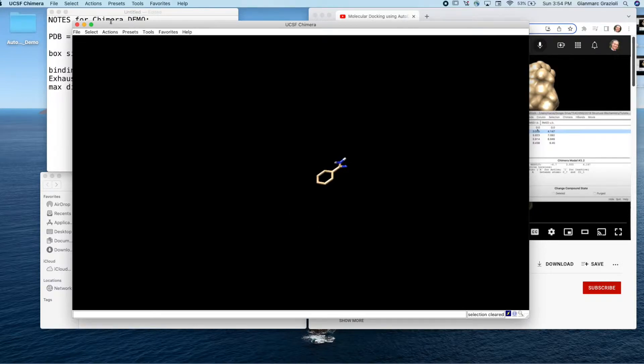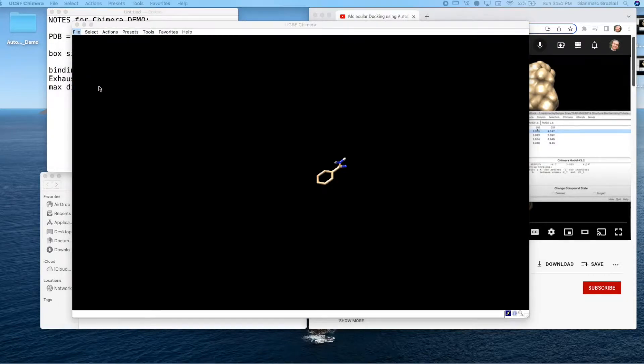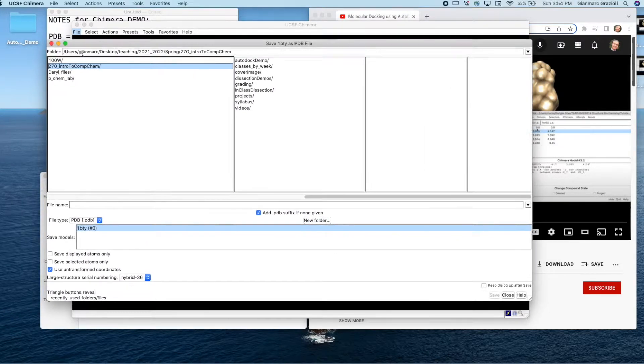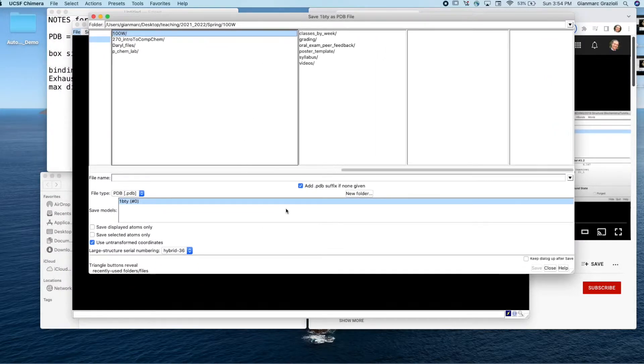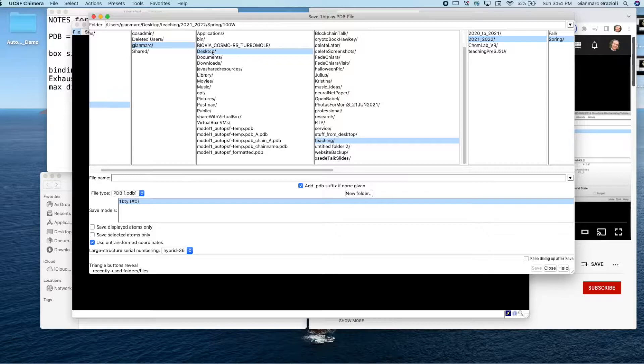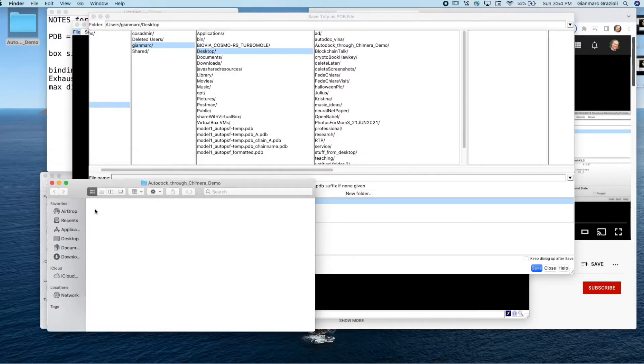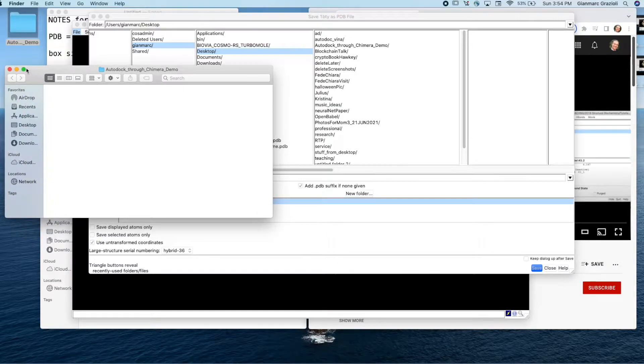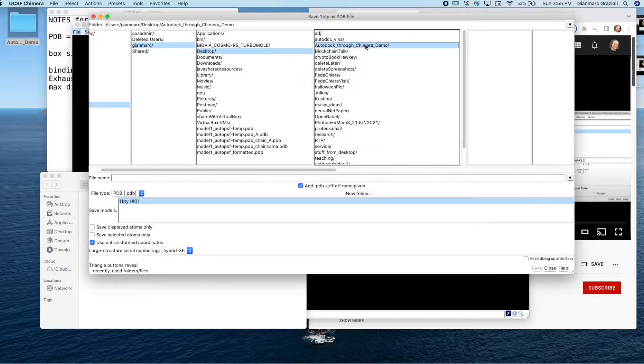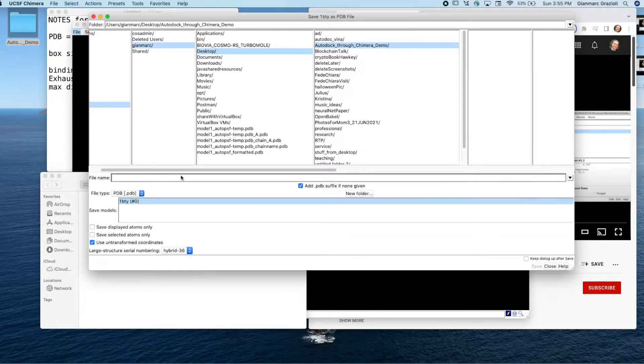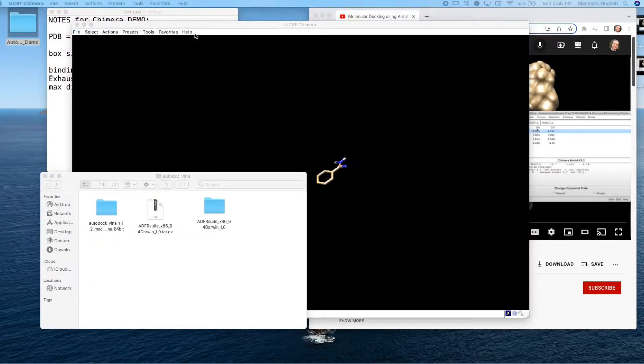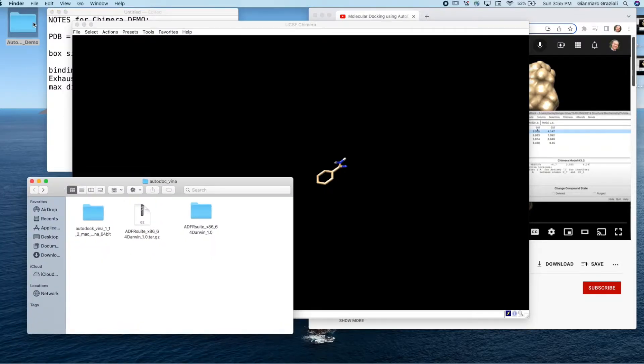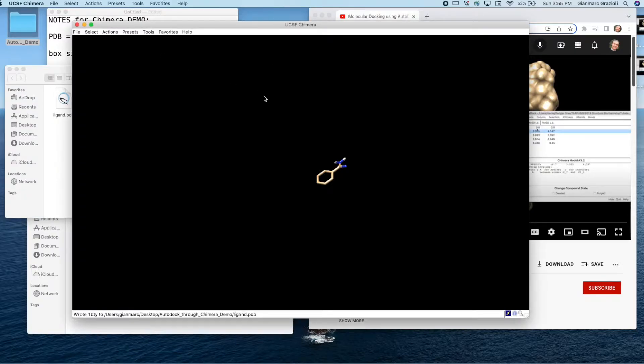Now we want to save this thing. So now we say file, save PDB. This is the menu that pops up. I'm on my desktop. I created this empty directory, Autodock through Chimera demo. I'm just going to save it there. And then the file name, we're going to call it ligand. Hit save. And now we see that in this file right here, now we have a ligand.